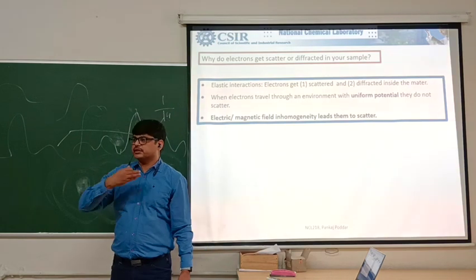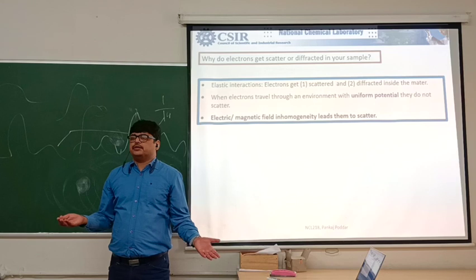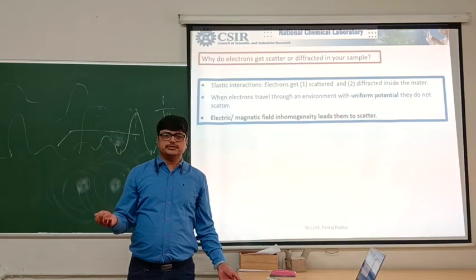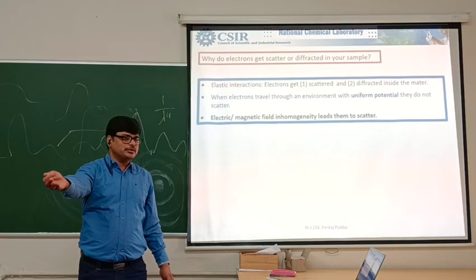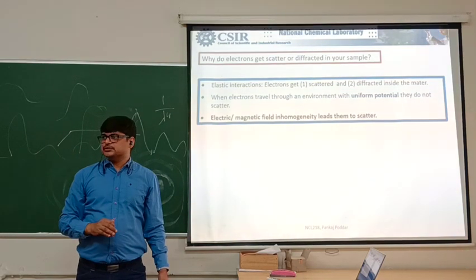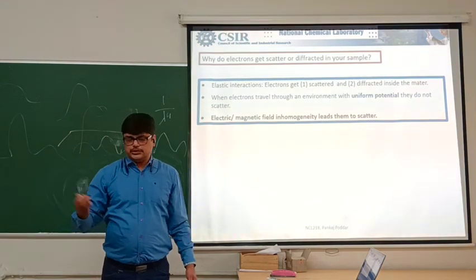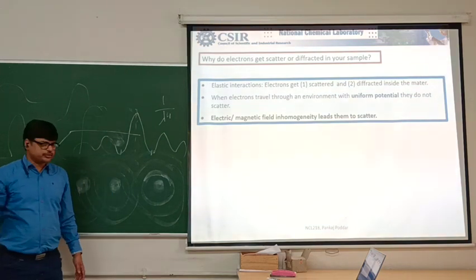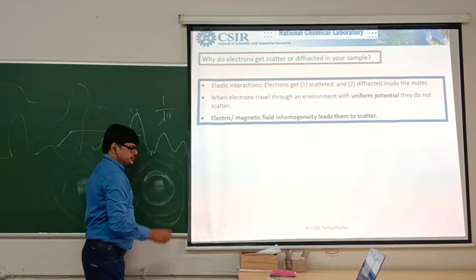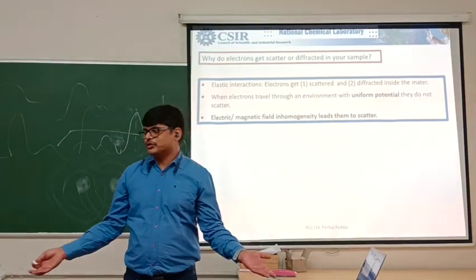So nowadays they don't just expose this expensive silicon to the outer environment. There is a protective glass over there. The refractive index of the glass is around 1.6, whatever, and the air refractive index is 1. So immediately from 1 to 1.6, photons will be bouncing back. So they have corrugated the glass, anyway, it's not a very big thing. But they made a coating actually. There is no conflict because I don't know the coating material, I don't want to know.